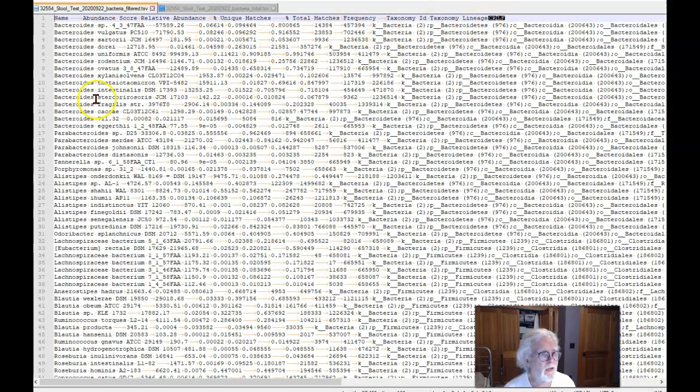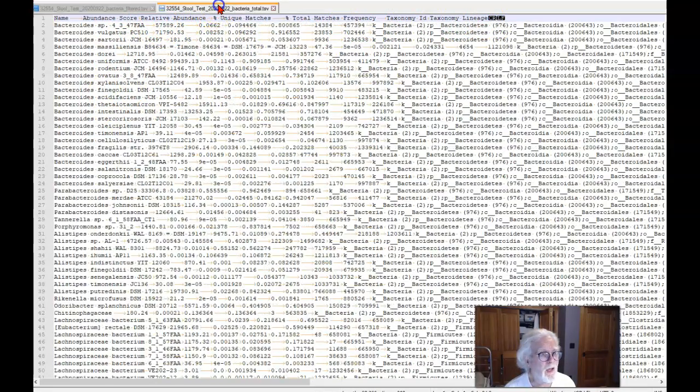Notice they have the same headings. The numbers are very similar: 57589 there, 57589 there. In general, I would say go for the total, mainly because there's some dark matter, things which they may not necessarily be able to identify. So that is basically the fundamentals of it.